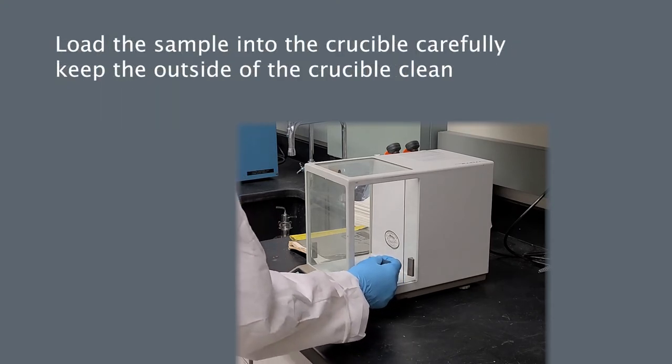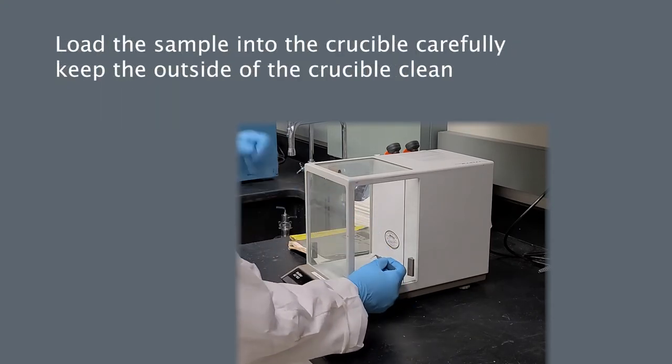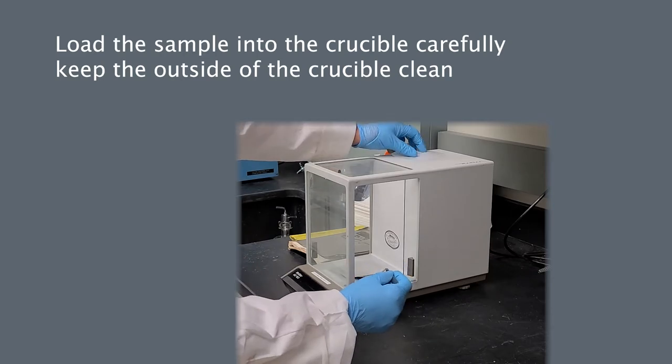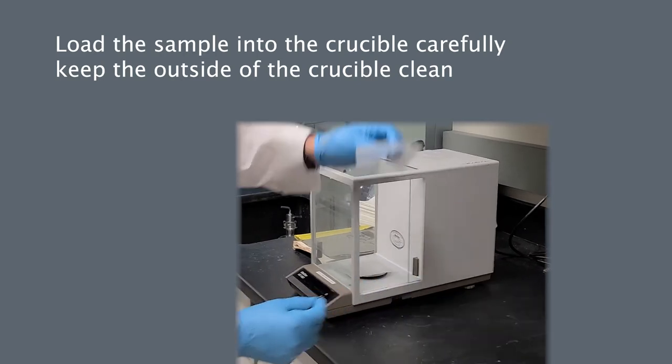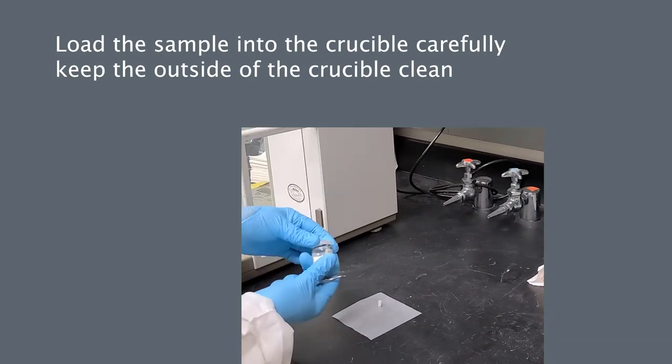You can now load the sample into the crucible. Be mindful to keep the crucible clean by placing it on a piece of weighing paper.